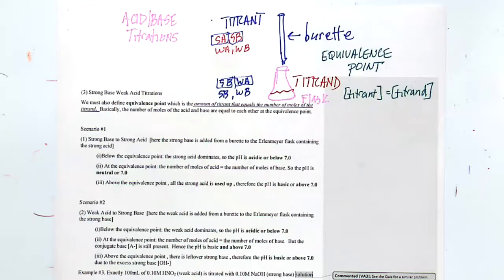It's got to be the slightest pink possible, such that it turns the faintest pink. If it gets any pinker, then you added too much. So that's the trick, and that's the rub. It's getting there. So this is more art than science, right?